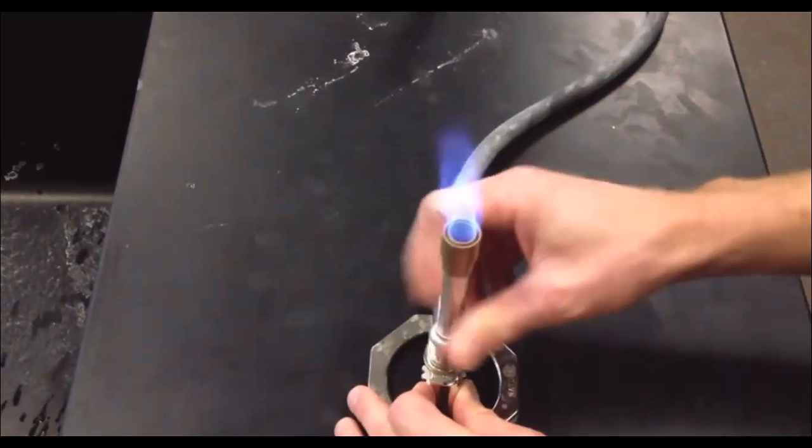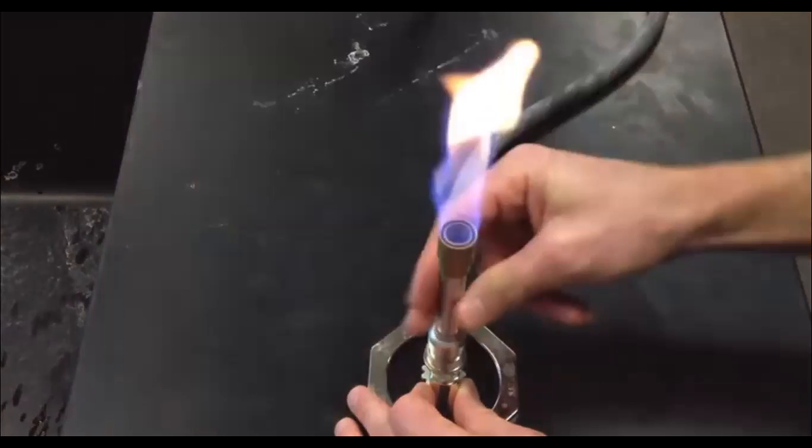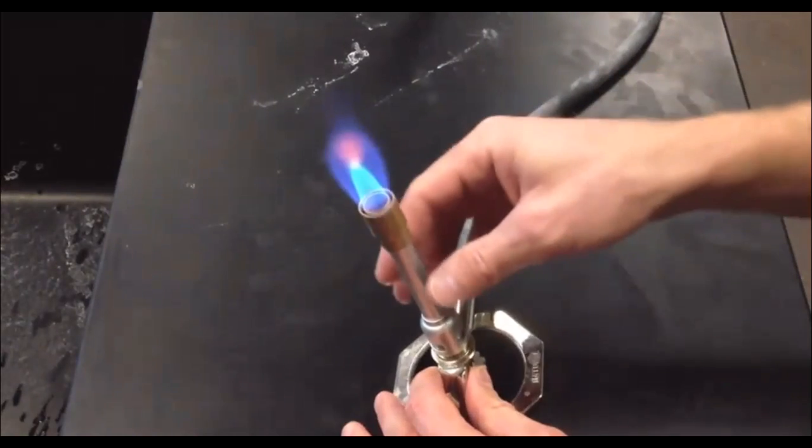All right, so if you find a really orange flame, this is what you need to adjust. You need to adjust the base here. Get it back down so you have basically a flame within a flame. You've got the inner blue flame and the outer blue flame, and should be about a 1-inch flame there and about a 2.5-inch flame there.